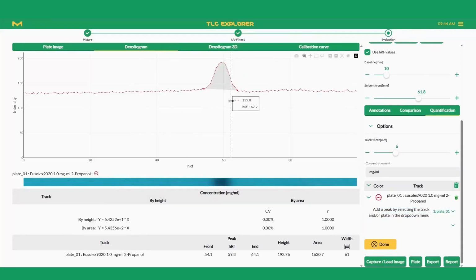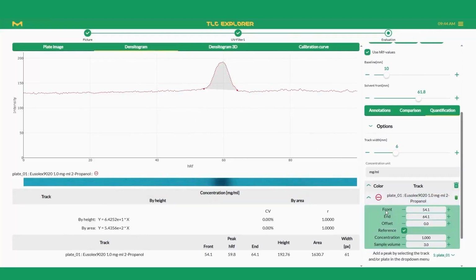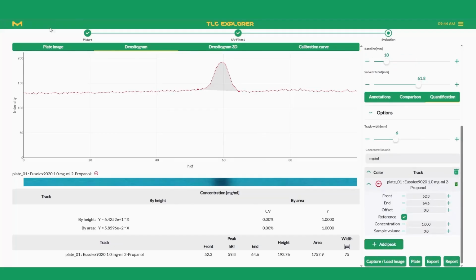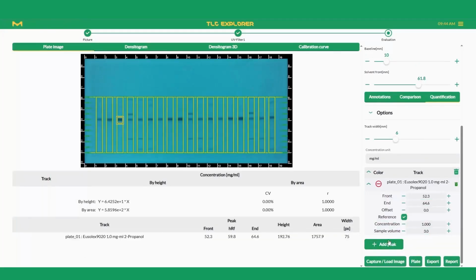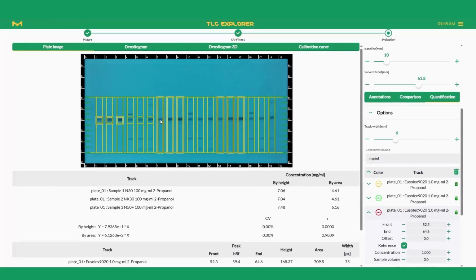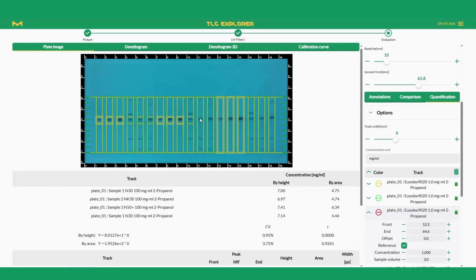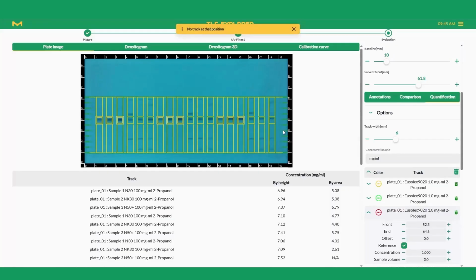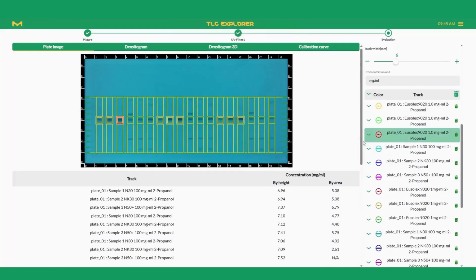To adjust the integration limits, simply click on the plus and minus button. It is also possible to adjust them by clicking in the respective field and setting a new value. After the data is set, it is easily possible to add new peaks by clicking on the respective tracks. The predetermined values are copied to them automatically. If necessary, make adjustments for your integrated tracks.